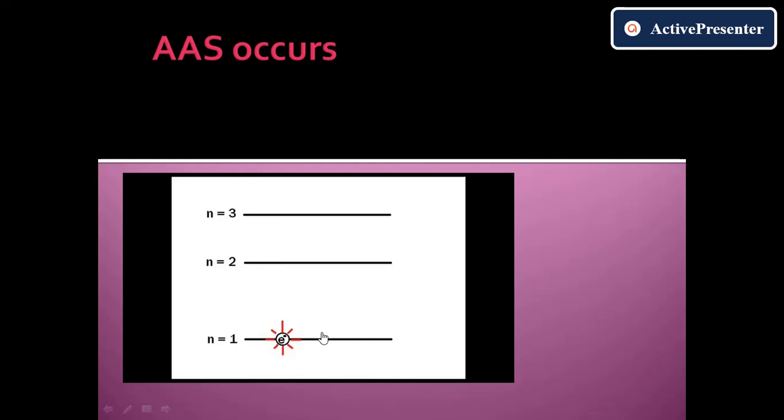You can see how the photons are absorbed by the atom, and when it is absorbed, there is a transition. Since the excited electron is unstable, it will fall again to the ground state and retain its mean position, so there is an emission. This is atomic absorption spectroscopy when it is due to the unexcited atoms. This is how we can see it.